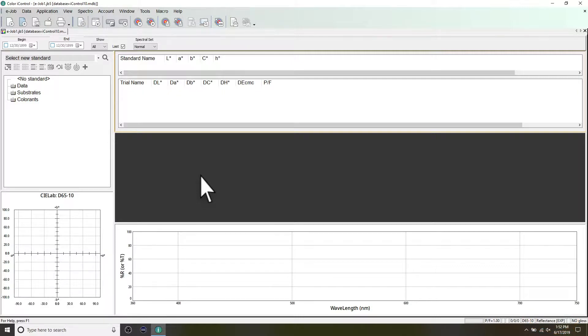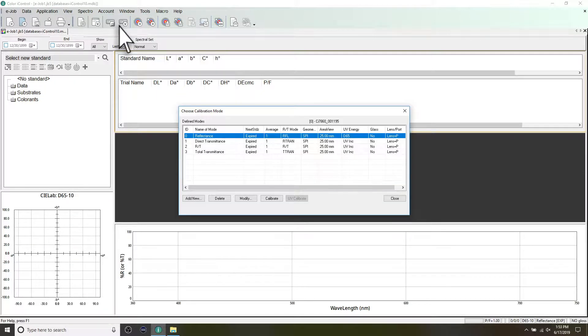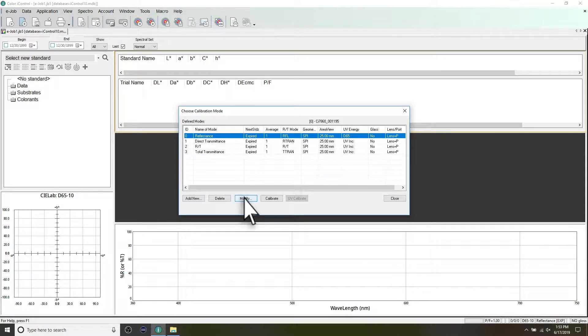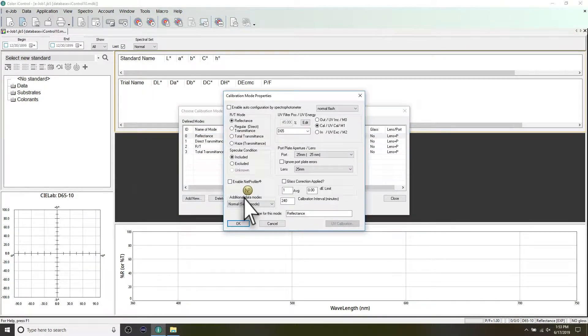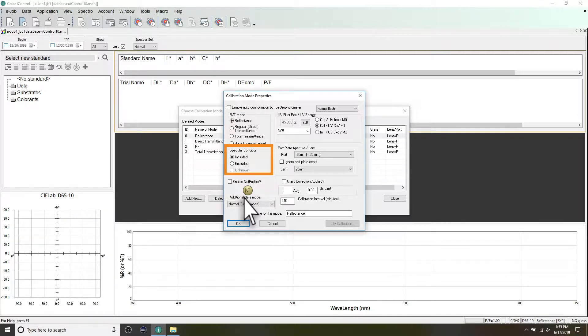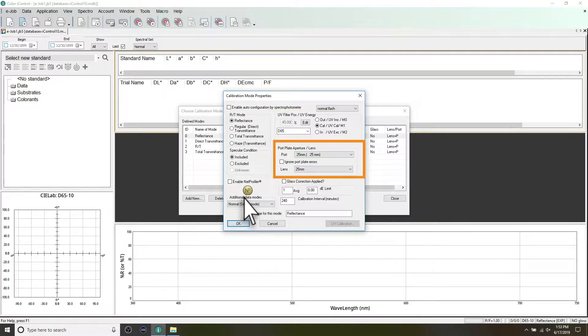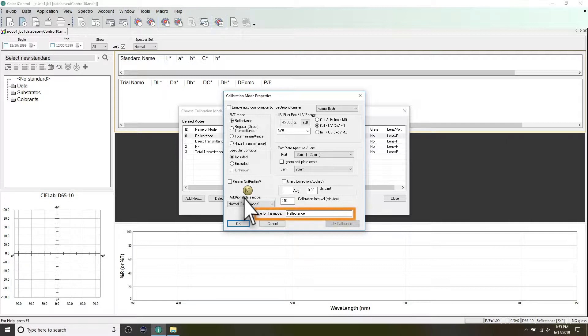Calibration is initiated through your software. A different calibration mode will need to be created for each configuration you'll be using. This consists of a measurement mode, specular condition, UV filter position, port aperture, and lens size, as well as a few additional settings. Each calibration mode can be named to allow you to easily identify it.